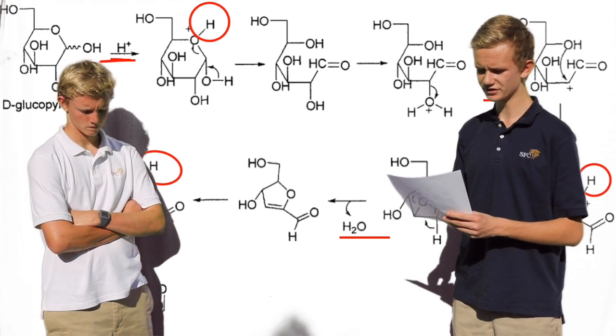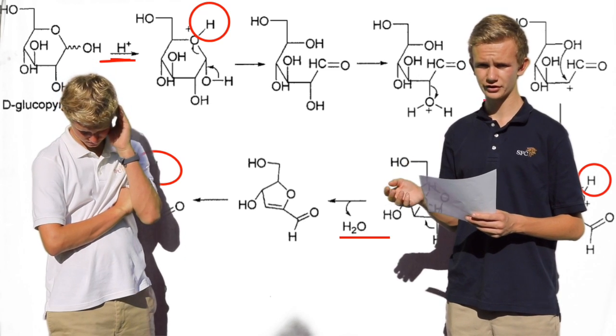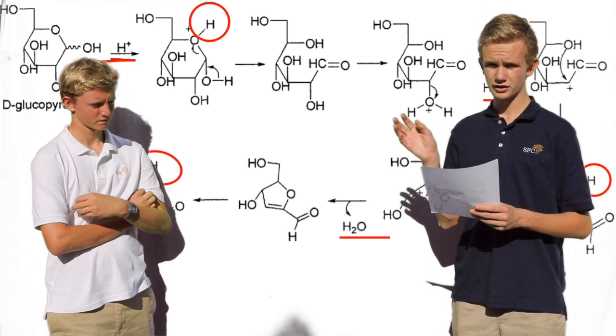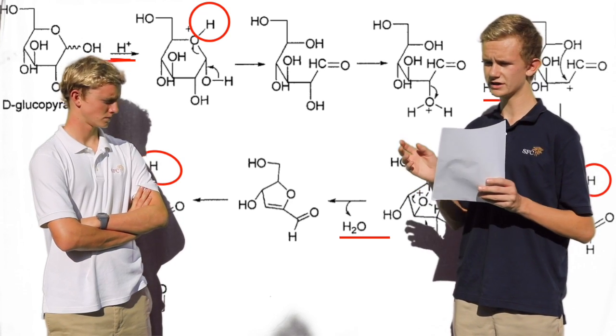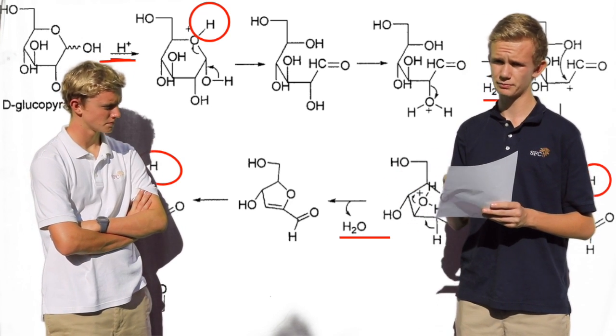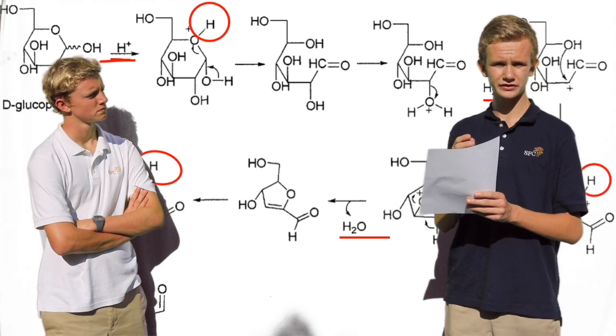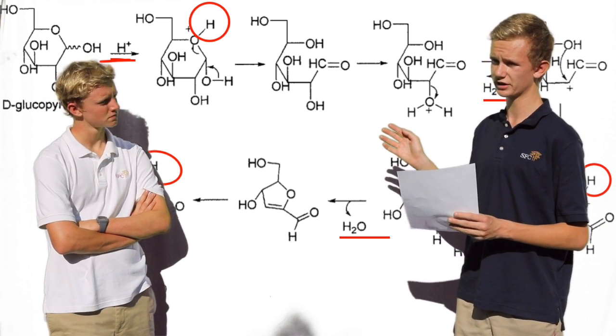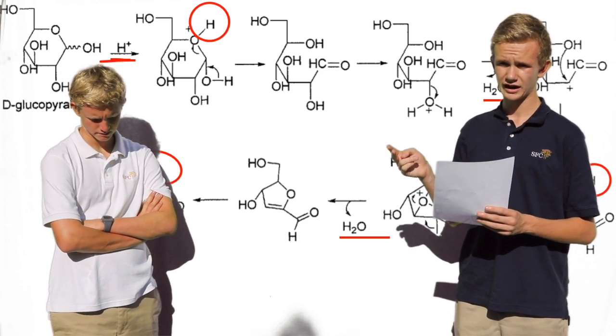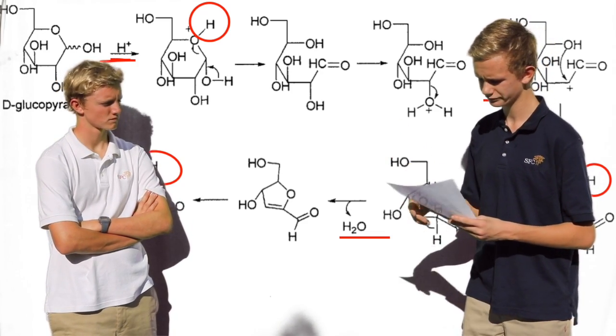So this is the sulfuric acid going with the sugar, and you're seeing the byproducts released. And what it does is the sulfuric acid splits apart the sugar into just carbon and water. But this is the actual splitting of the water and the sulfur oxide.